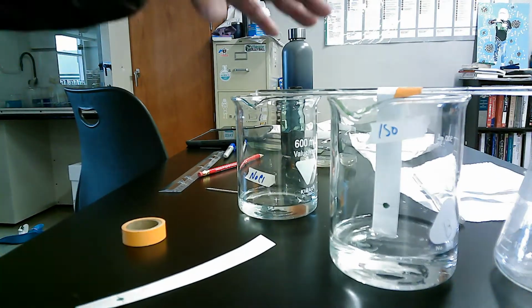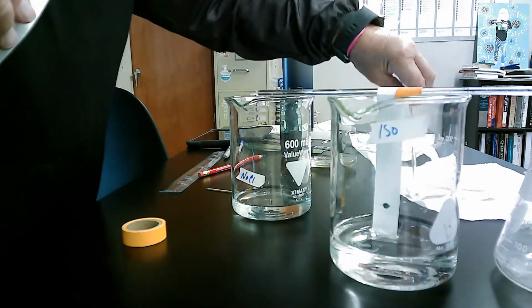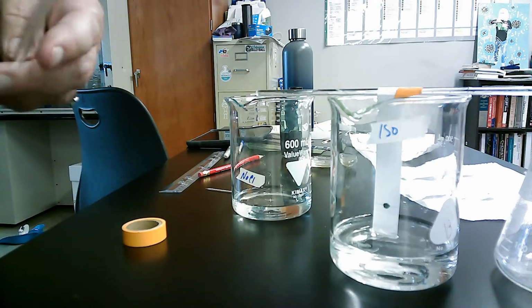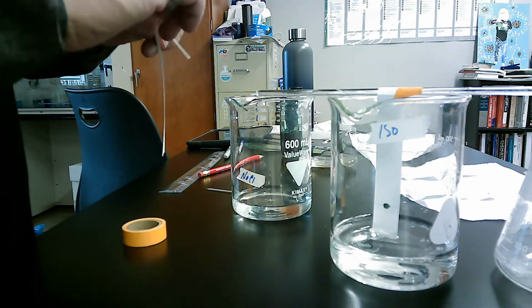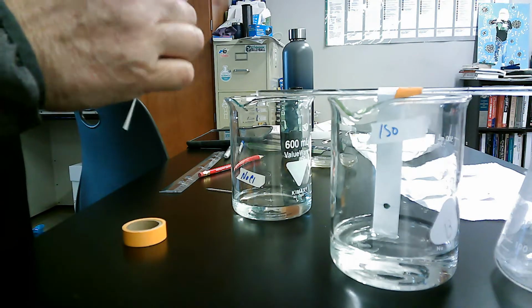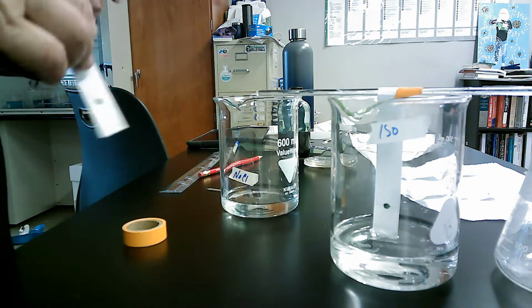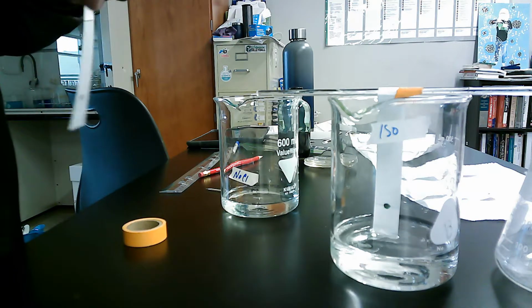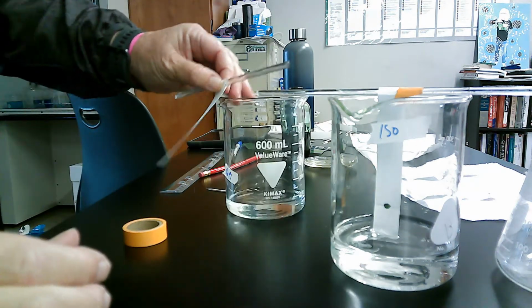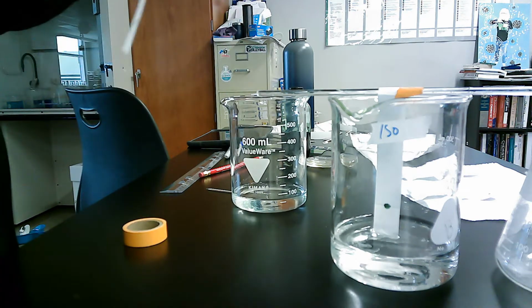So I'm going to do the same thing, set up the same one in the other one. And then I'm just going to let it go. Once I let it go, I'm going to let it go for a while until it separates, until it gets fairly close to the top, maybe a couple inches, or I run out of time. So that should be pretty close on that one.